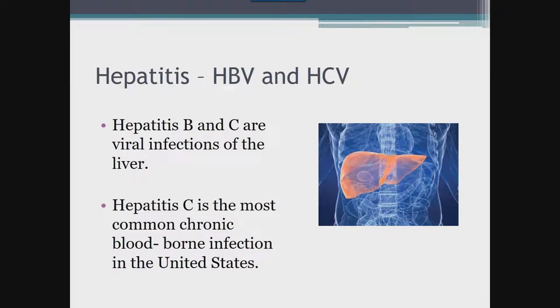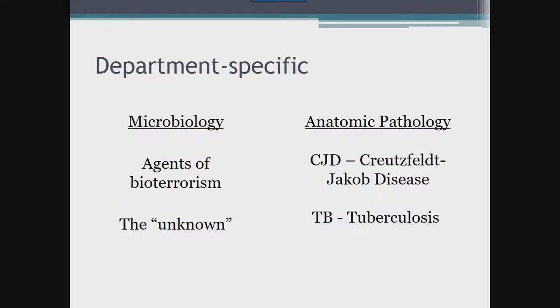Hepatitis B and C are both viral infections of the liver, with hepatitis C being the most common chronic bloodborne infection in the United States. Exposure in the laboratory can occur during processing and specimen handling tasks. While most clinical departments receive mainly blood and some body fluid specimens, anatomic pathology and microbiology receive a whole other array. Microbiology deals with blood, body fluids, tissue samples, and may encounter unknown agents that could be agents of bioterrorism. Anatomic pathology deals with fresh tissue, and agents of particular concern for histotechnologists and cytology prep personnel include Creutzfeldt-Jakob disease (CJD) and tuberculosis.